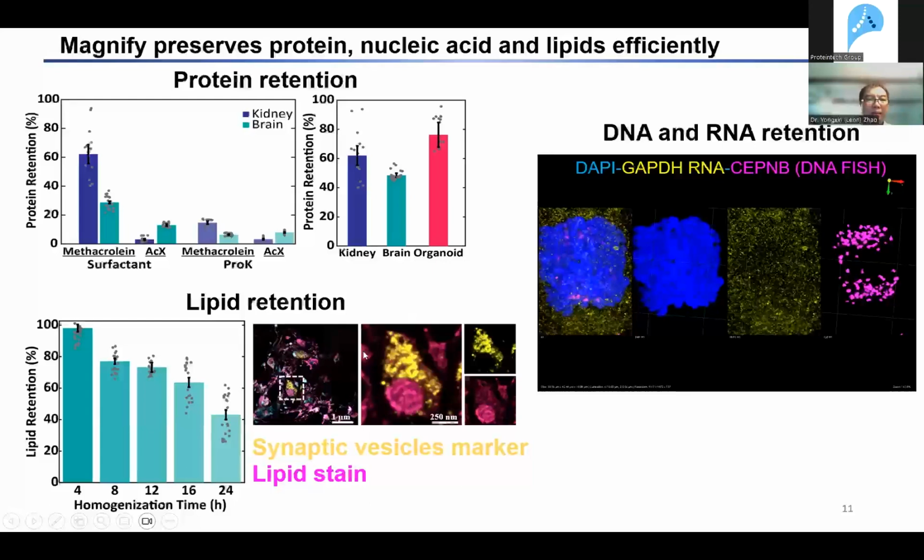This is a presynaptic compartment, the whole thing. Here, the yellow is the synaptic vesicle marker. We use a Proteintech synaptophysin antibody. It's a rabbit polyclonal antibody, very robust. And then we also use this conventional lipid dye to stain. This purple little guy over here is the mitochondria. You can see the crista structure, actually, thanks to the 11-fold expansion.